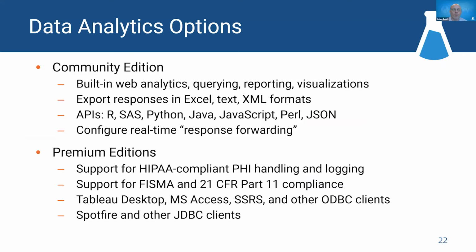And then since it's LabKey server, all of those data analytics options, everything we've talked about for the last 4 days, as well as what some of our speakers today will be speaking about. Wide variety of options for analyzing the data directly within the response server or pulling that data into downstream systems.